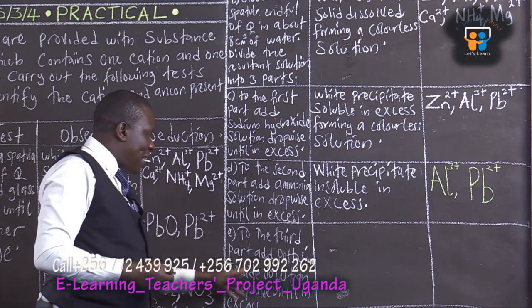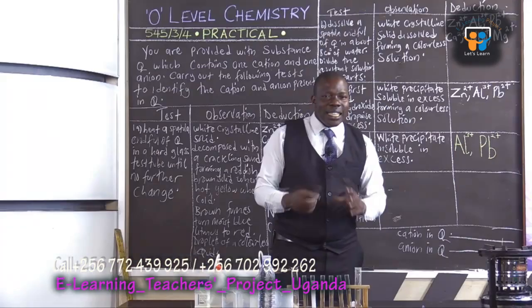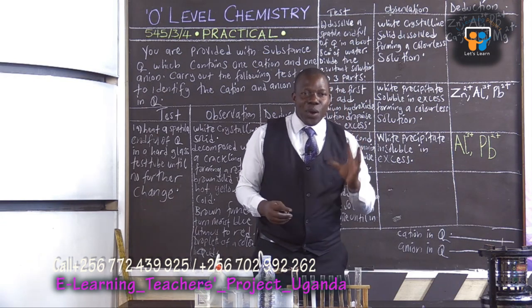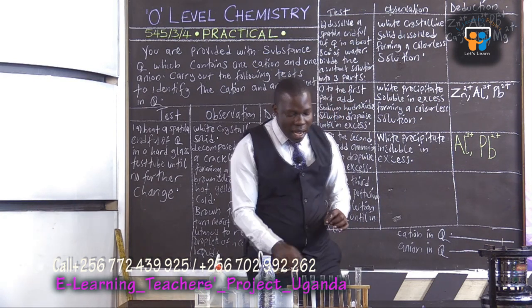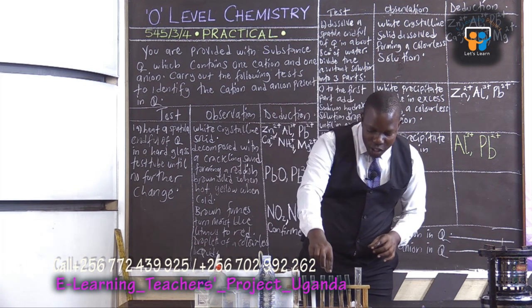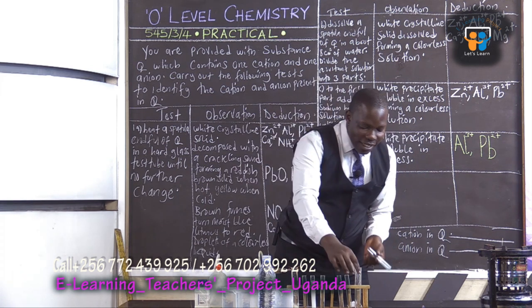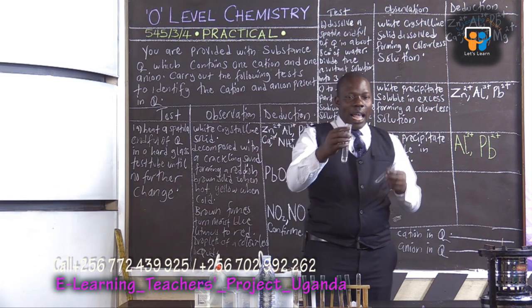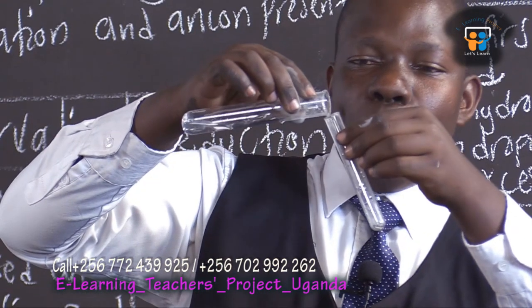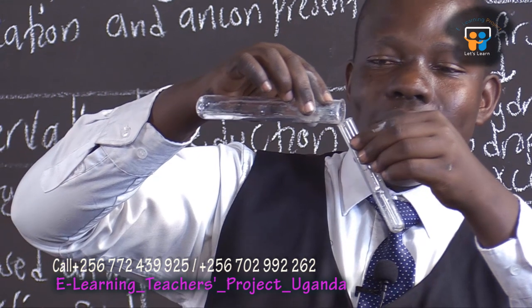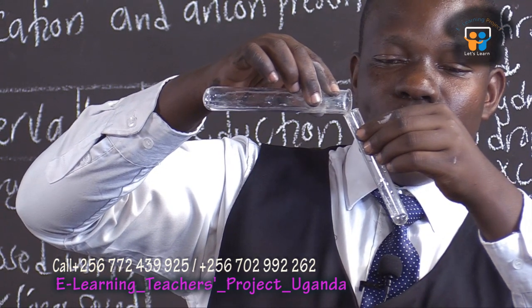We are going to add potassium iodide, ladies and gentlemen. We are going to pick the third test tube, clean as it is, and then we pick a small portion of our sample. There we are, ladies and gentlemen.